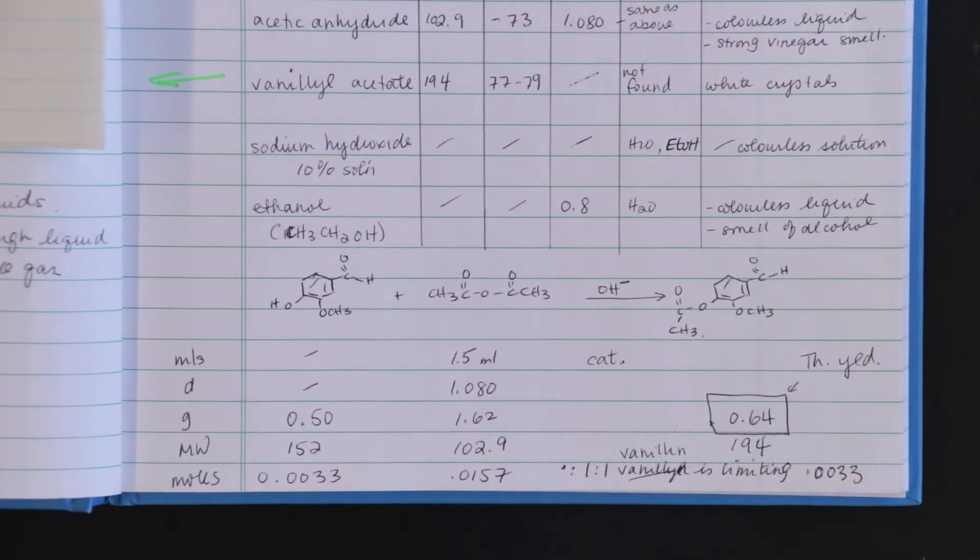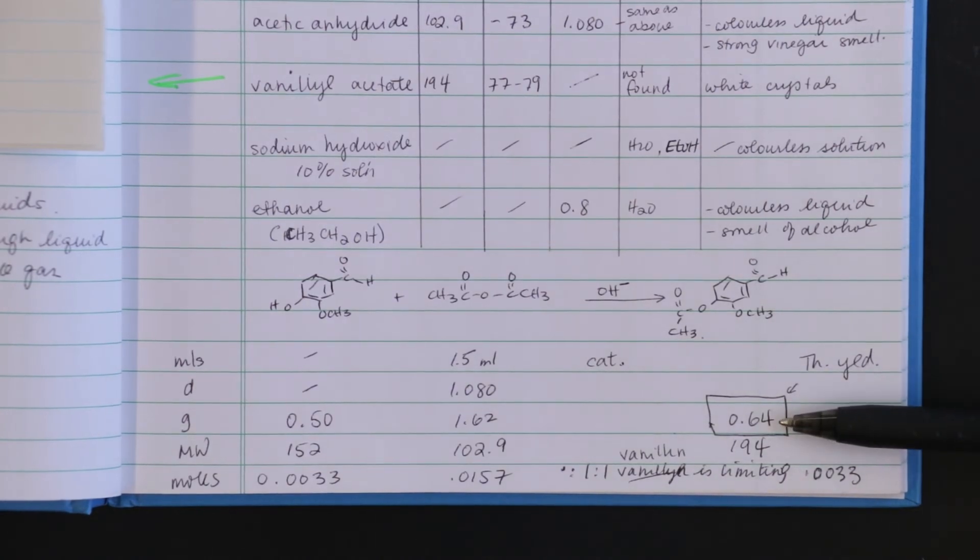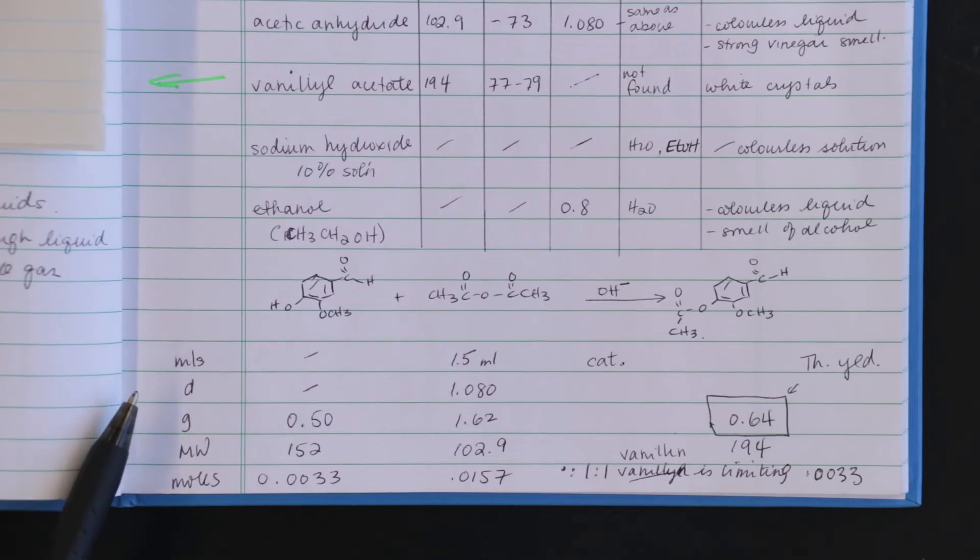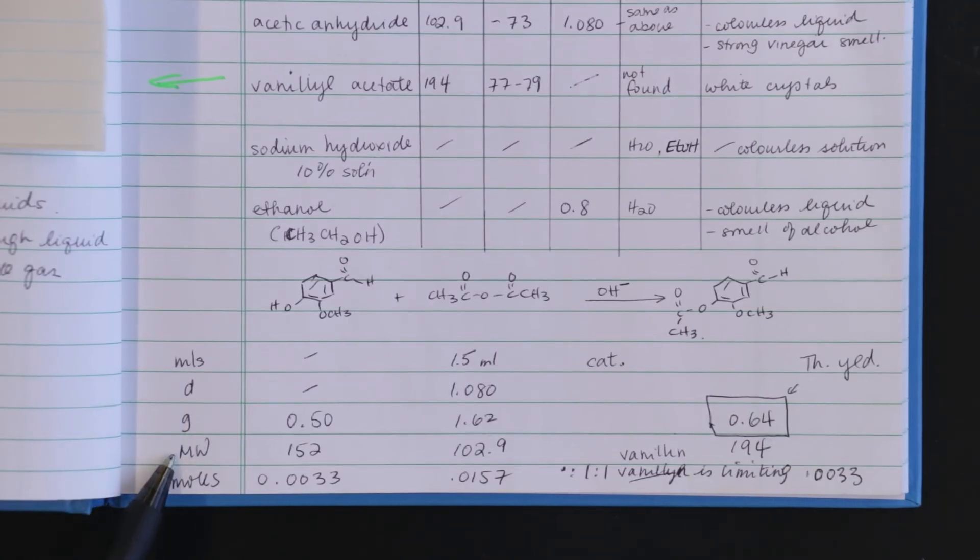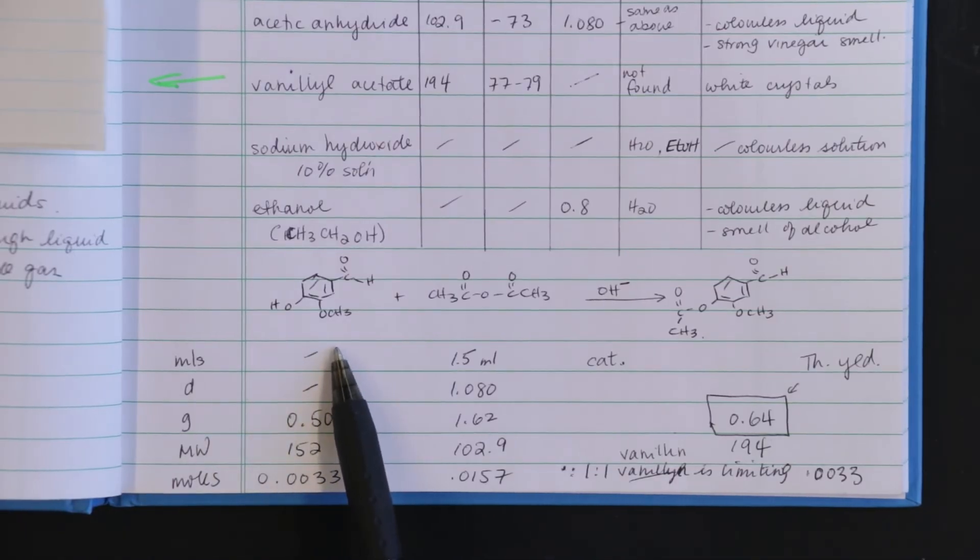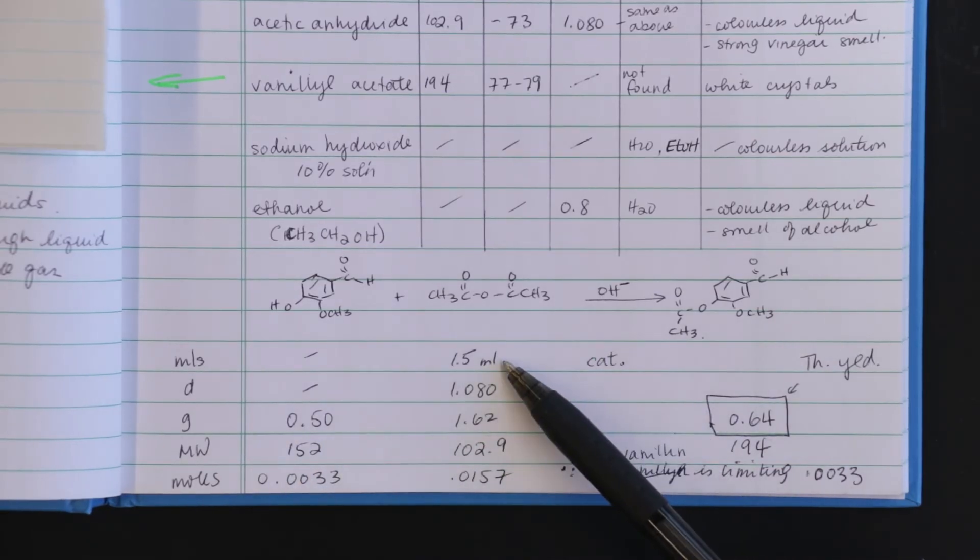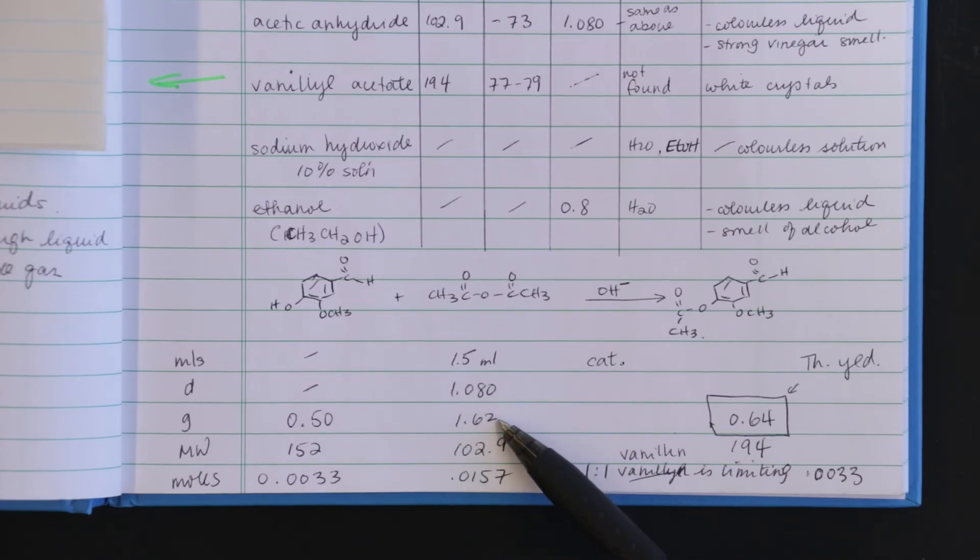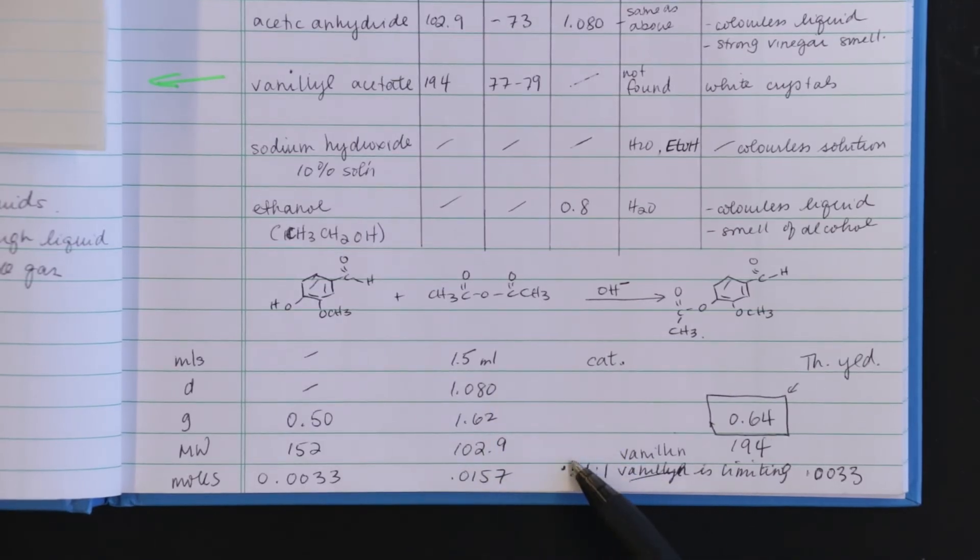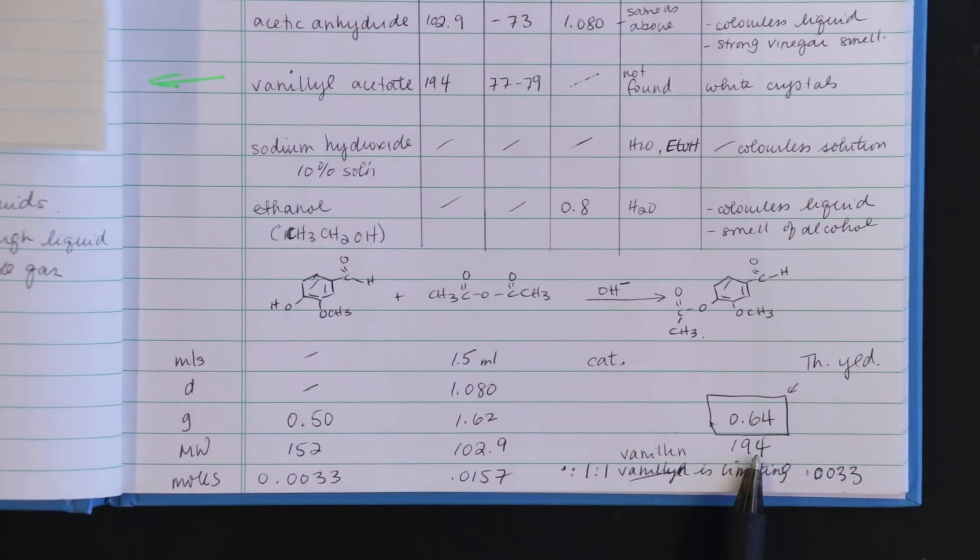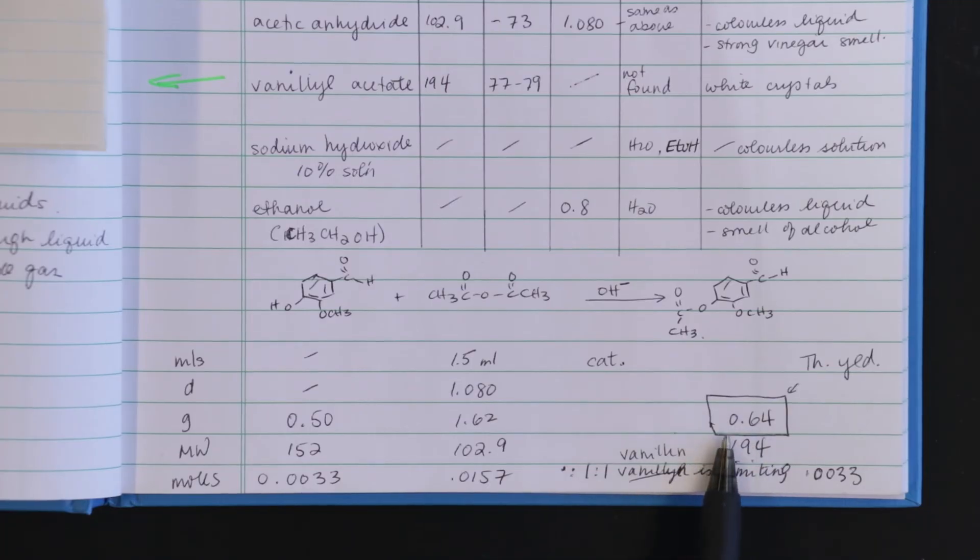When doing a synthesis I must do a theoretical yield calculation. This is how much product I am expecting if the reaction was a hundred percent successful. I have my equation and underneath I have my values. Mills, density, grams, molecular weight, and moles. The starting material is a solid so I don't need mills or density. I can go directly to the number of grams. The acetic anhydride is a liquid so I need mills, density, to calculate the number of grams and continue to moles. Because it is a one-to-one reaction this is a limiting number of moles. So this is the number of moles of product I can get. I know the molecular weight so I can calculate the theoretical yield and I put a box around it to make it obvious.